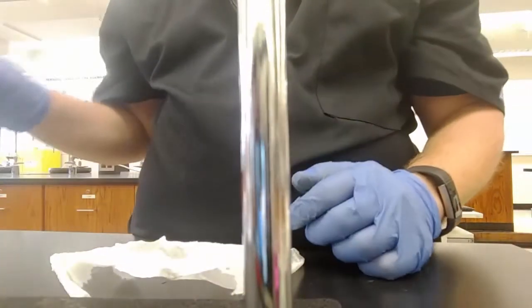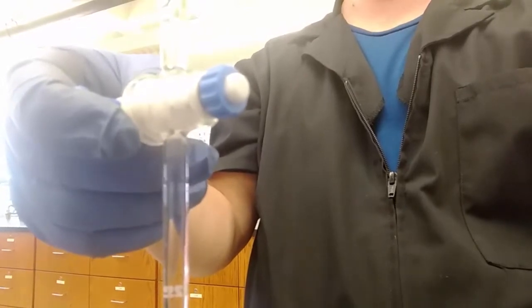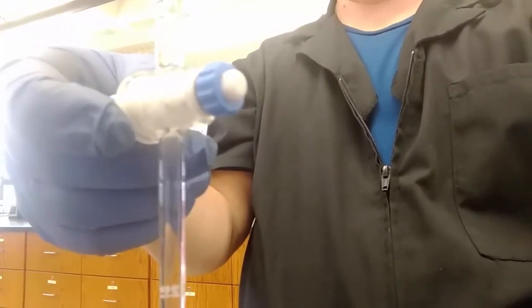And now, flask number two in. Valve on for 17 milliliters, right? It was a little over 17, so instead of 2.59, I got to go to 19 point something, so I can just let her rip. Full blast. 18, just in case. I'm slowing down at 18.